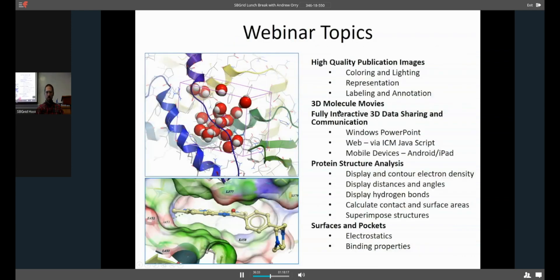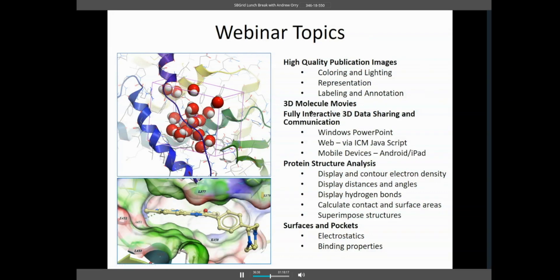The webinar topics — we're going to go through a lot of these things pretty quickly, but the webinar is being recorded and will be available on the YouTube channel when it's done. So if you want to go back and check the recording you can get the individual steps, and hopefully by the end you'll be able to accomplish all of these things with ICM Browser Pro. We're going to start with how to generate high quality publication images.